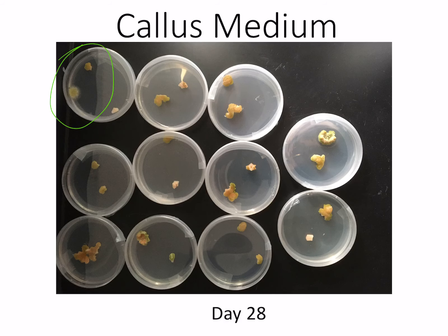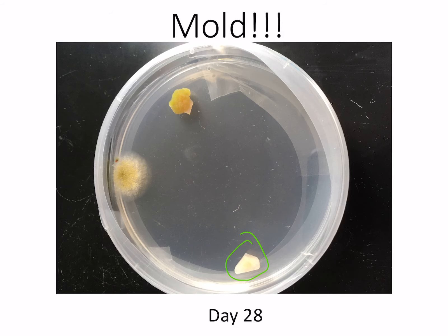We unfortunately have some mold on one of the plates. Fortunately, it's one where one piece of tissue must have been killed by the bleach, and the other piece didn't show a lot of growth. The mold is isolated — it's right over here in this corner — and it looks like there's a break right here in the parafilm.